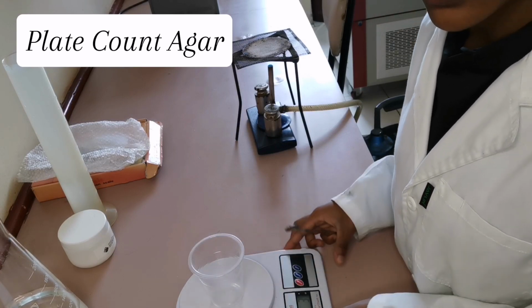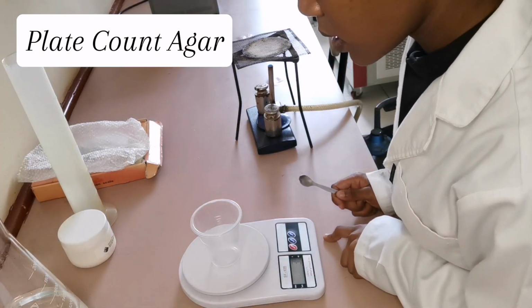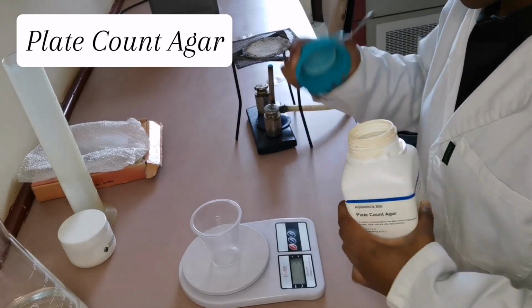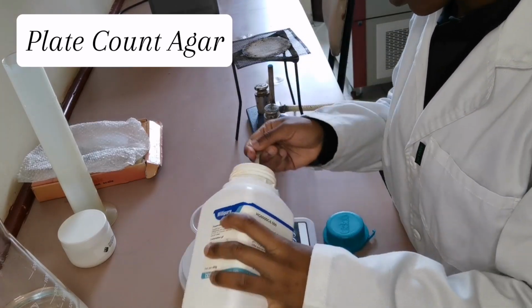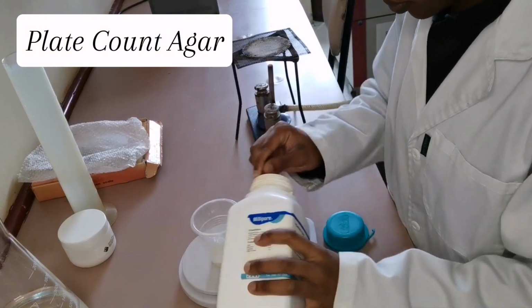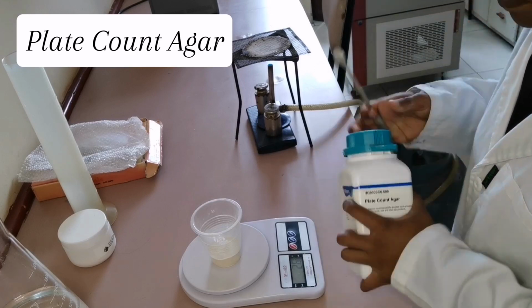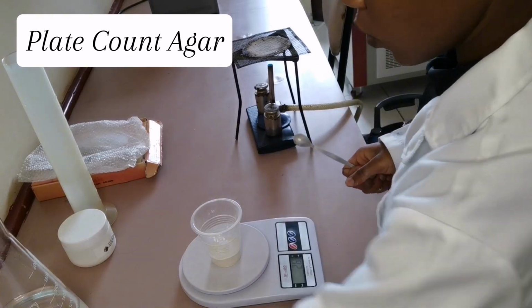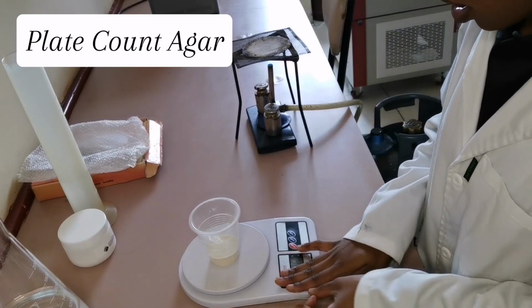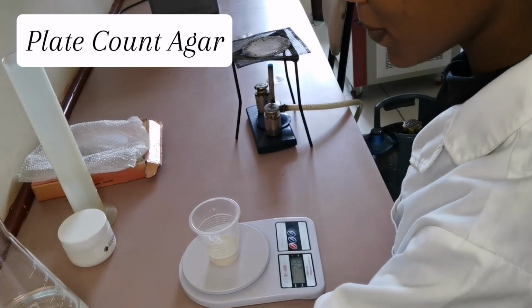Okay, so the initial value here is 3 grams. Now we are all done measuring the 23 grams of the plate count agar powder.